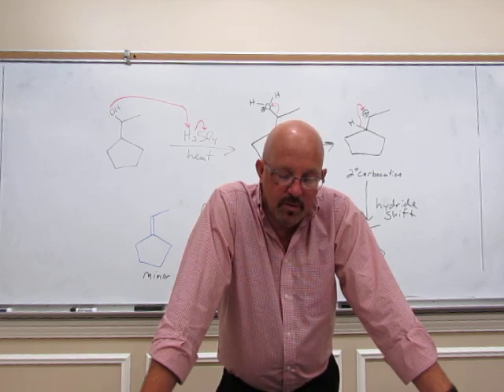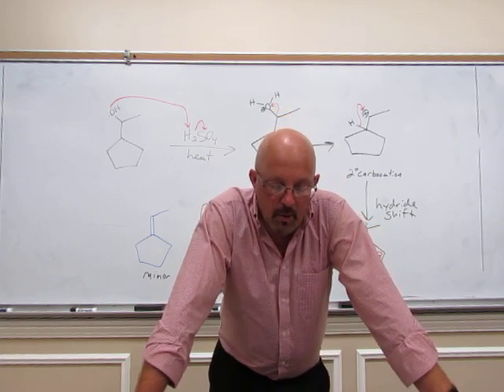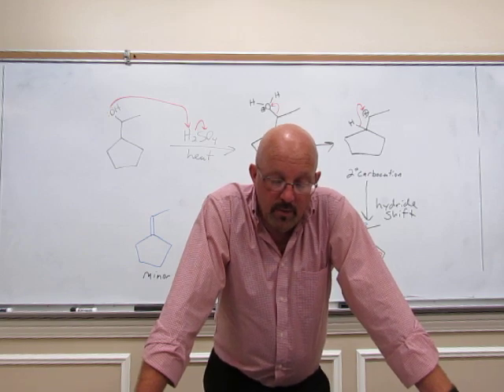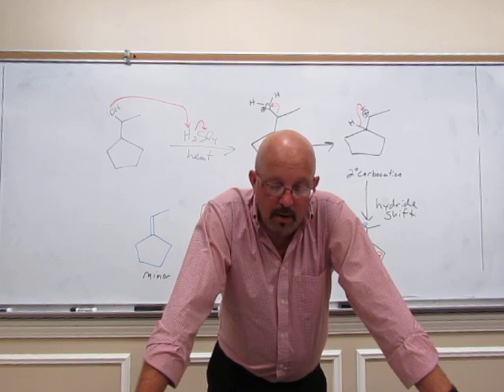And you'll collect the portion that boils up to 43 degrees. Don't go above that. Now, this time pre-weigh your vial that you're collecting into. Pre-weigh it before you set everything up. Get a weight of it empty, because we're going to be calculating a percent yield. So we will distill up to 43 degrees, and once that's finished, you'll weigh the product, and you can subtract the weight of the empty vial and get the weight of that product. And you will calculate a percent yield.